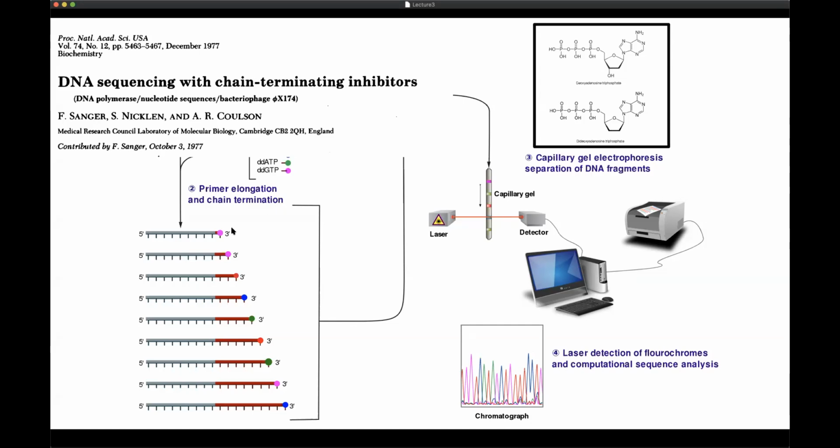So with natural dNTPs, it would continue through, and here it would fall off. So you basically terminate the reaction and color it. What this creates is that when you have a DNA sample that you're trying to sequence, these labeled dideoxy molecules get incorporated, stop the synthesis, and create a ladder of molecules of different lengths, right? First position, second position, and so on.